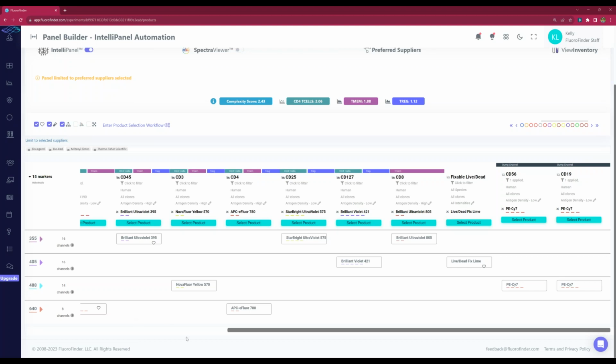Sometimes we'll give little warnings that just say, hey, you should know that this has a significant amount of spectral spillover into something else. But what matters most is this. This is the quantification of that spillover. So as long as these values remain low, you know that it's not a problem. And people have always asked me regularly, is there a good complexity score? And that is not the case.